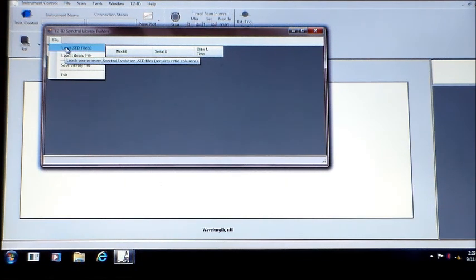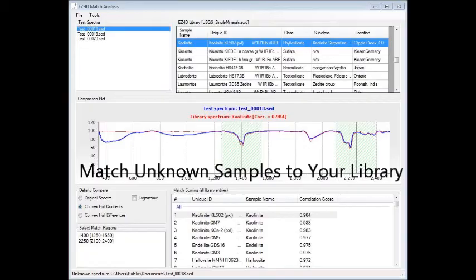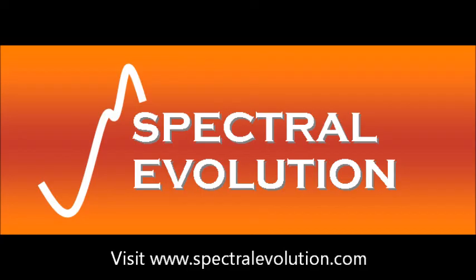You can now scan unknown target samples and EasyID will match them, by highest probability, to the known custom sample library you have built.